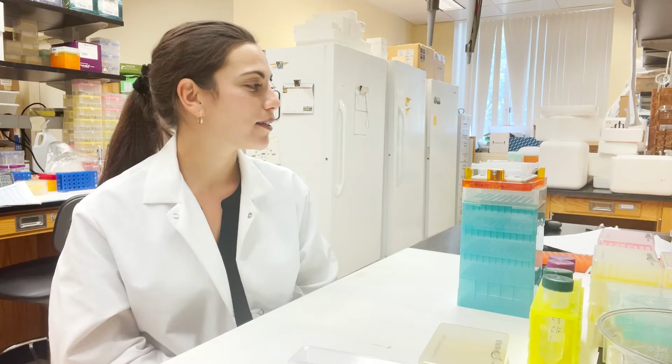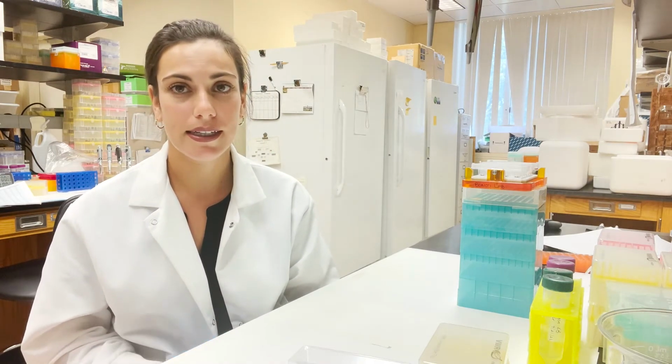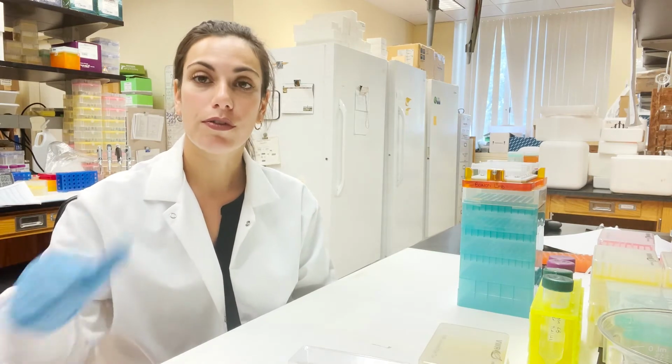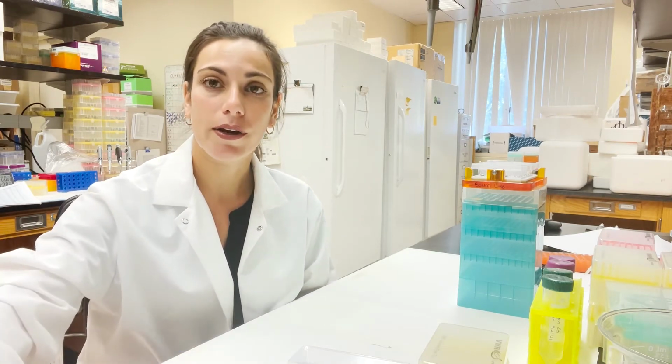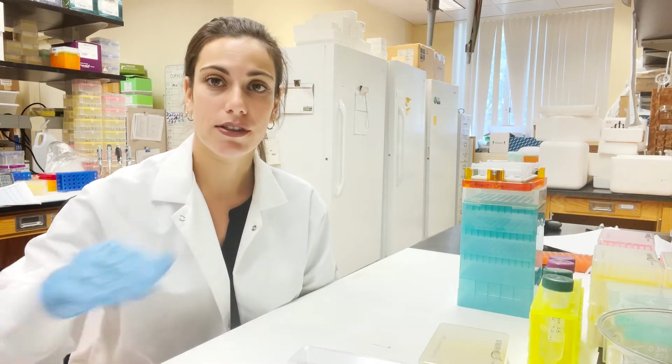The next few steps are definitely the most tedious of the ddRADseq pipeline. What we're doing is we are removing the supernatant and going through a series of ethanol washes to clean the DNA fragments. And it is tedious because we need to remove all of the supernatant and then all of the ethanol completely. So first we'll go in with the larger tips, the 200 microliter tips on the larger multi-channel, remove the bulk of the liquid, and then we go in with the finer tips, the 10 microliter tips, and remove any excess of the supernatant.